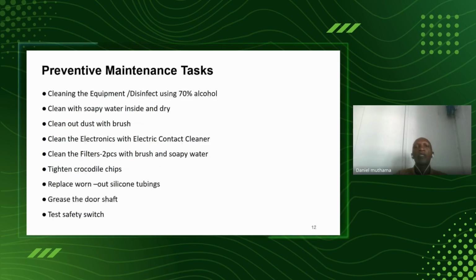This is daily checks. Preventive maintenance tasks. Clean the equipment using 70% alcohol. In that case, you are disinfecting the equipment. Clean with the soapy water inside and dry.